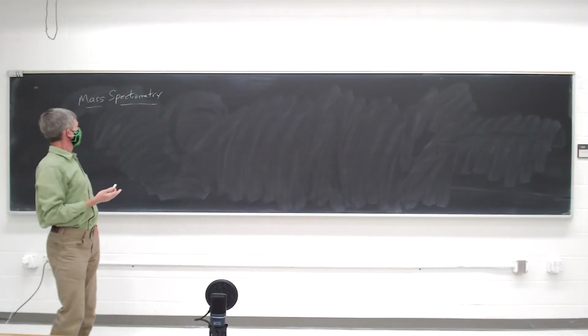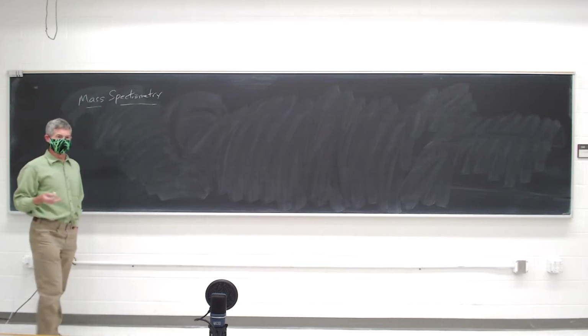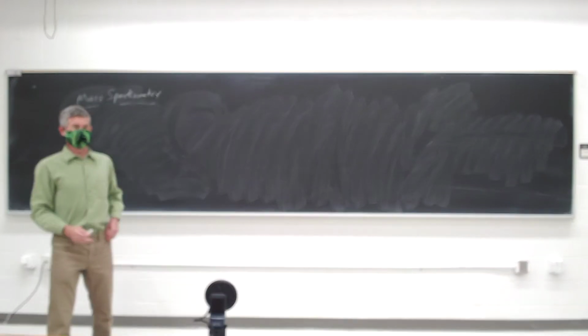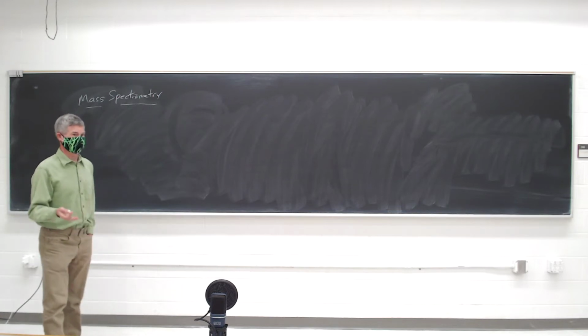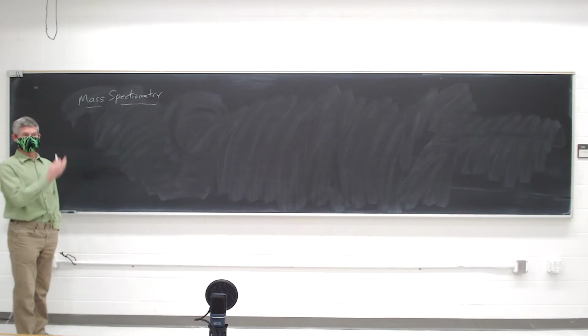And this becomes particularly relevant because there's a lab coming up for some of you this week that requires you to actually interpret the fragmentation pattern of the mass spectrum. And I'll have to do this lecture again for my lab section tomorrow because I don't think Dr. Cummins is getting to mass spectrometry yet. So if you're in my lab section, you'll probably hear a lot of this.